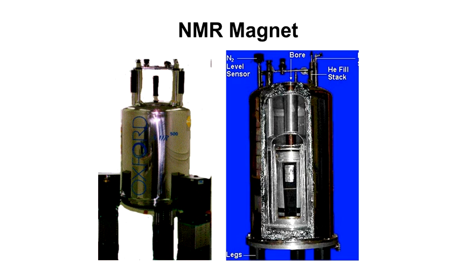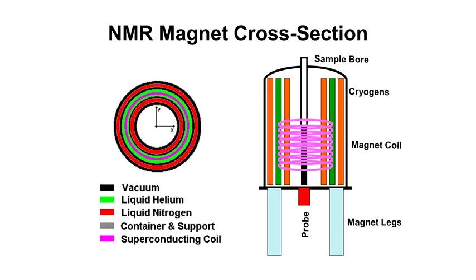constant. There's an inner core, which is filled with liquid helium, and an outer core, which is filled with liquid nitrogen. And inside that, they use space blankets, which are sort of insulation and vacuum seals. So this is, again, sort of a cutaway view if you were to look at the position of where the vacuum lines are, which are in black, the liquid helium, which is in green, and then the liquid nitrogen, all trying to make things as cool as possible.